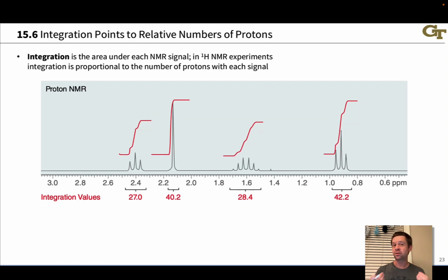and the lowest whole number ratios of the integrations don't match up with the total number of protons in the molecule that we know from the molecular formula. So this is highly useful information. An integration is often represented with an S-like curve above each signal.